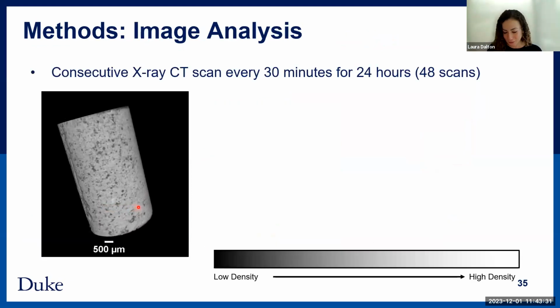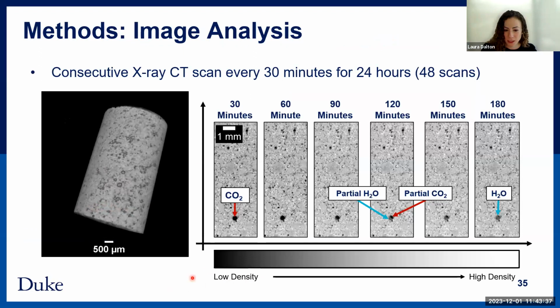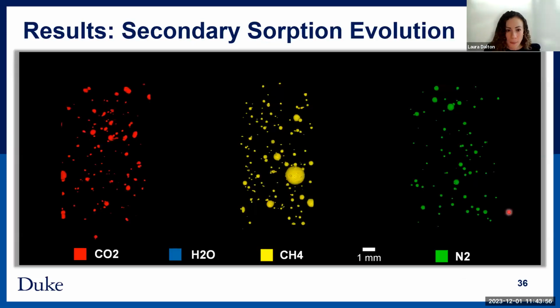But so I did that for 24 hours, 30-minute scans, and here's one of the samples. And again, like we mentioned, low density, high density materials. So initially this pore was filled with CO2, and then we can see this slightly higher density material coming into that large pore, and that's what the water was, or it indicates that water was advancing into that large pore.